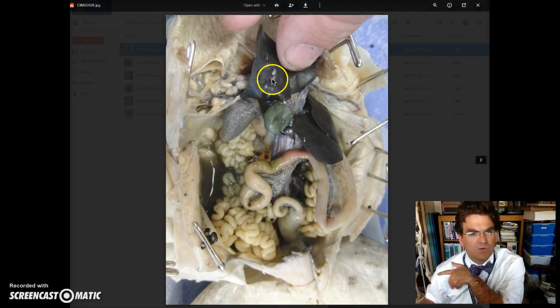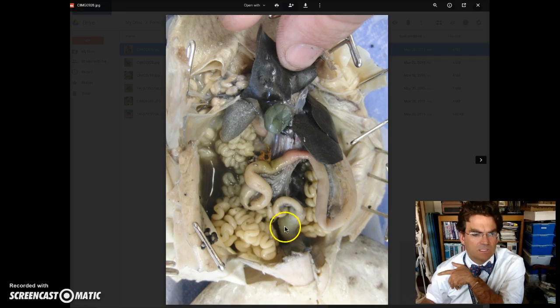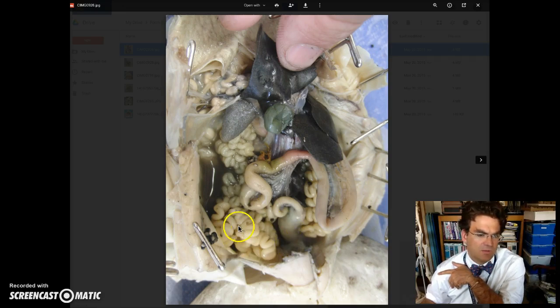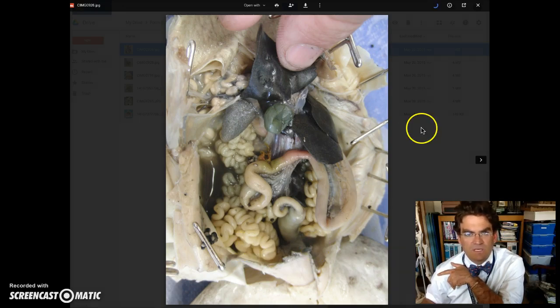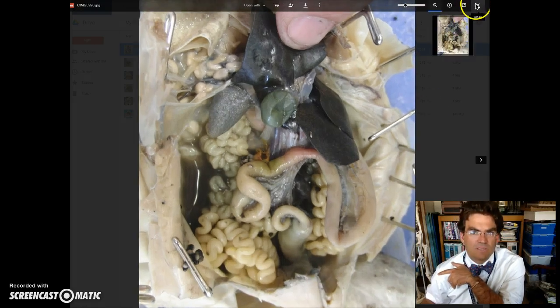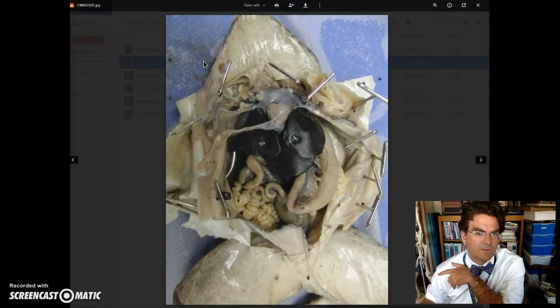In this picture you've got the liver, the gallbladder, the lungs, the stomach, the small intestines, and the large intestines. All these curlicues are the oviducts, which are part of the frog's anatomy. Let's take a look at another picture of the frog.